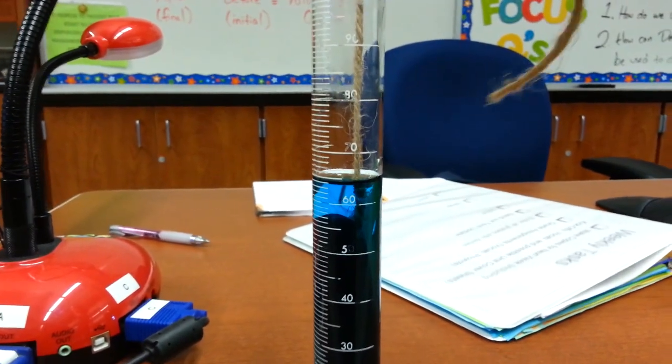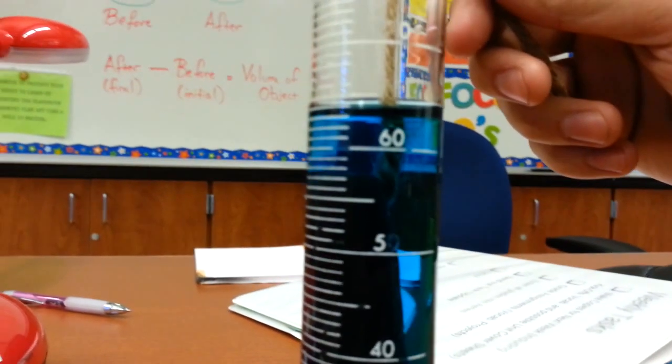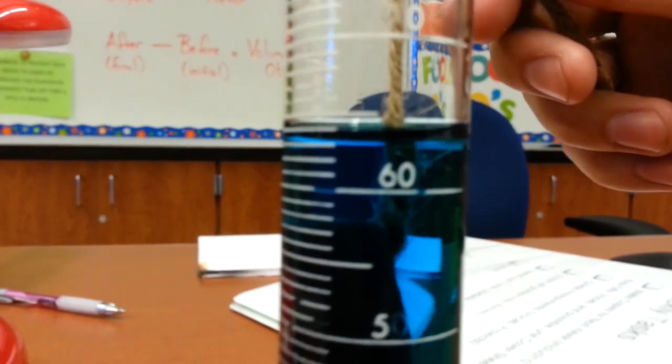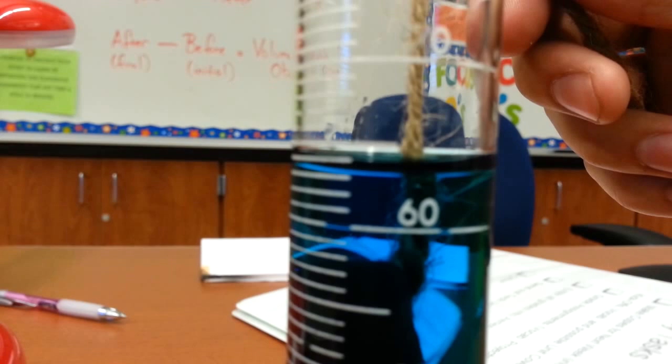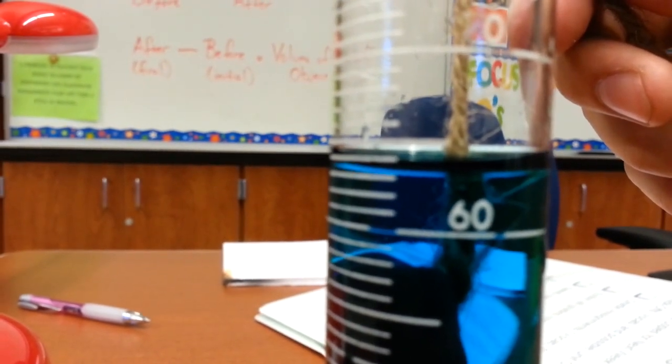And as you can see, as the object is submerged, it will raise the level of the liquid. Because the water is being pushed out of the way, it has nowhere else to go but up. So looking at that again, I'm going to measure again at the meniscus. It looks like about 63 to me. So let's go ahead and put that up there.